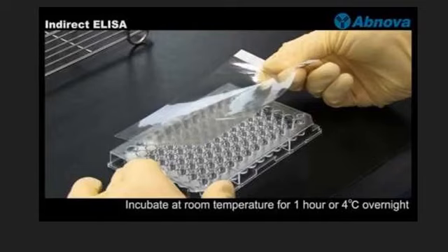Here we will watch a video on the indirect ELISA technique. Firstly is the coating of the antigen, and then we add the primary and secondary antibody, which is enzyme linked, then we add the substrate. In the first step, the researcher is preparing the antigen, which is diluted to 1 microgram per ml in coating buffer, 0.1 molar carbonate. We can use 1 to 10 micrograms per ml concentration of the antigen prepared.